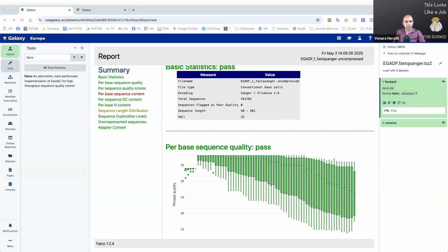Yes, nice. Okay. If you can remember, this is a box and whisker type plot. You have the median, that is the dark green one right here, and then the interquartile range, and also the 10% and 90% margins indicated by the whiskers. Okay.